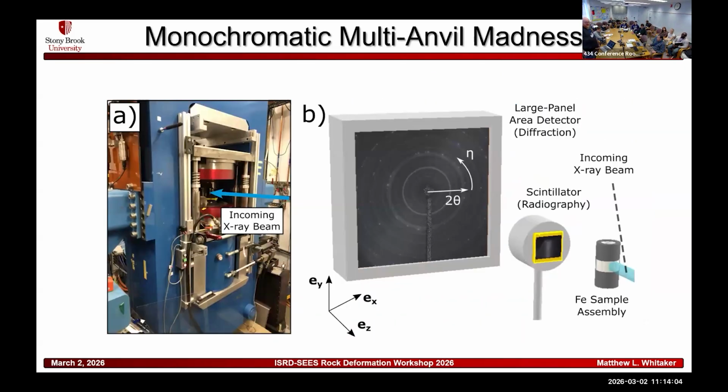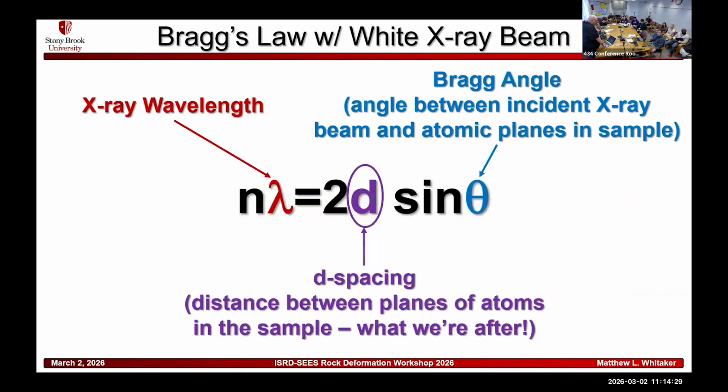This is an example of that. Again, we have our sample here. Shoot through, we can do the radiography measurements that Tim mentioned, where we are opening the slits up wide and we can take an actual photograph of the sample using a scintillator that lights up and really snazzy, sophisticated cameras. And then we have the X-ray diffraction patterns that are shown in the back, which Tim gave you an excellent example of, so I don't need to focus on that at all.